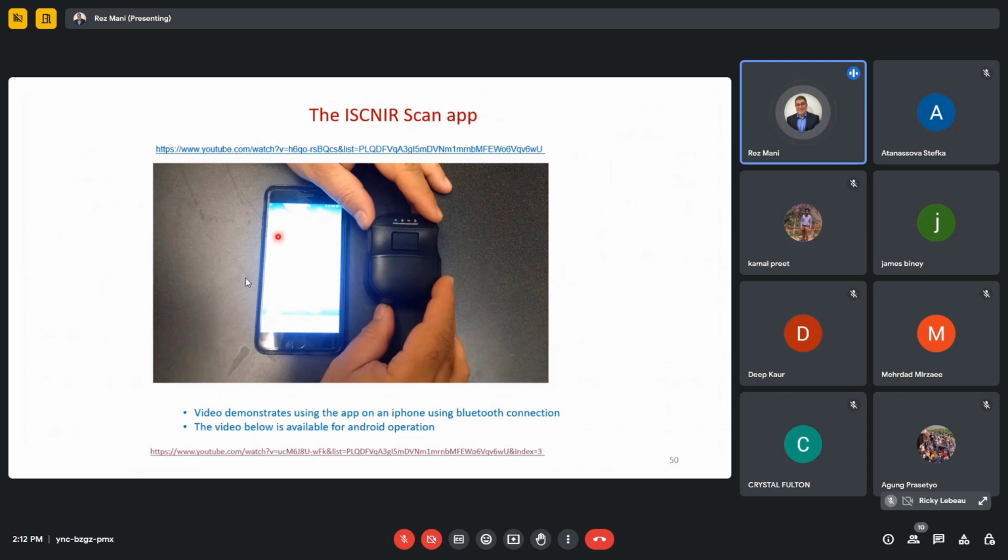After you measure, all the information will be in your phone, and you can connect it to the computer. If you have Android, you just connect it with a cable, and it will appear as an external drive. You can look under Documents, and in the Documents folder, you find all your CSV files. If you use iOS, it's slightly different.